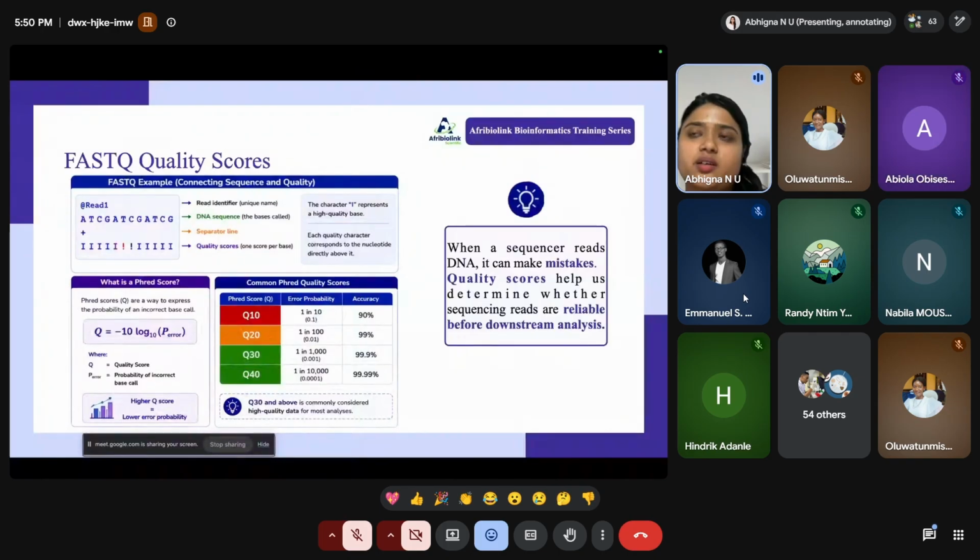For example, if a sequence read is taken but has very low quality scores, which may be due to the library preparation step, or low quality DNA isolated before the sequencing. Maybe there are many reasons for sequencing to be of low quality.